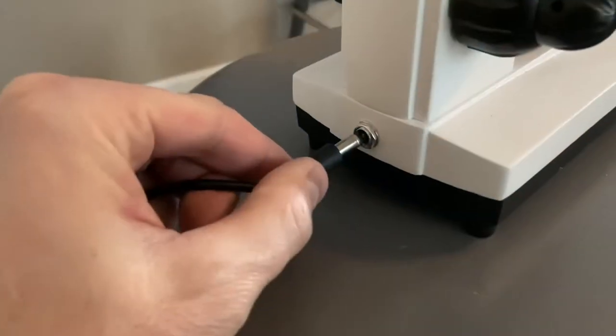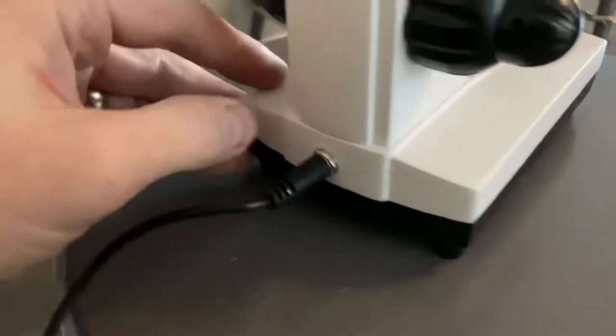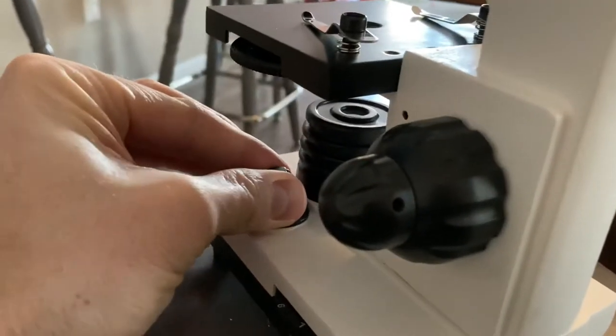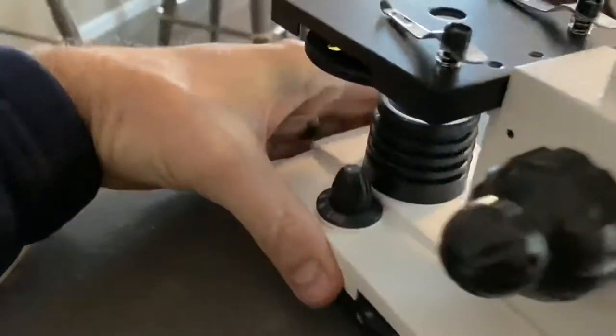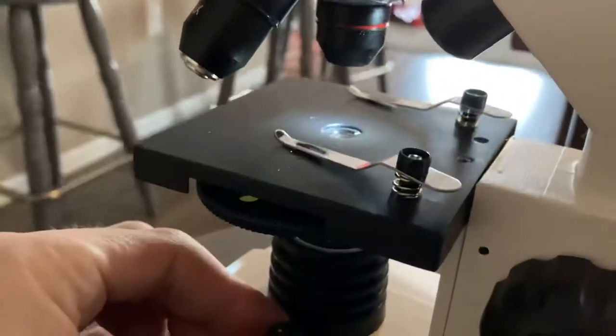One important consideration was batteries versus AC power, and I definitely wanted something that did AC power. It's pretty simple — you just plug it in. The cord could be longer, to be honest, but I'm not complaining too much. It's got your LED on/off switch right there.